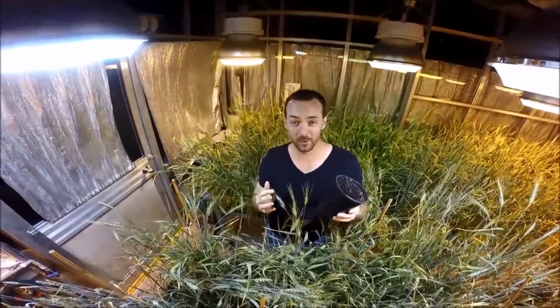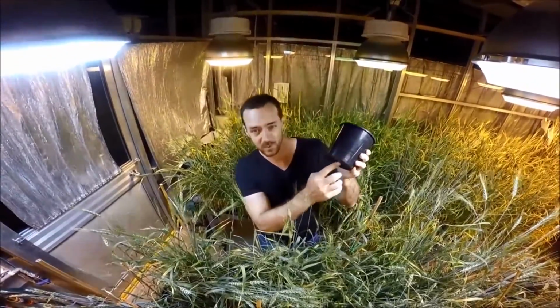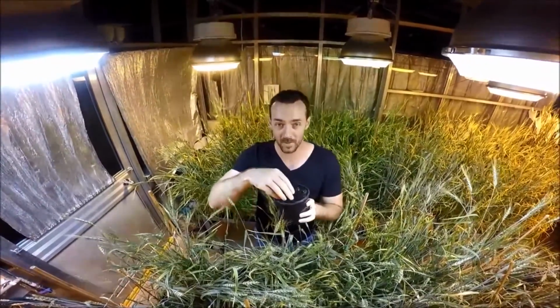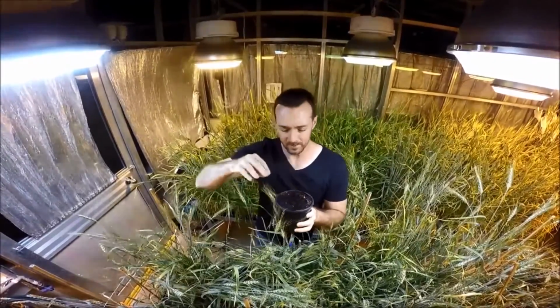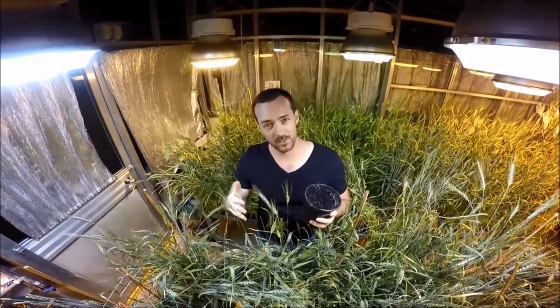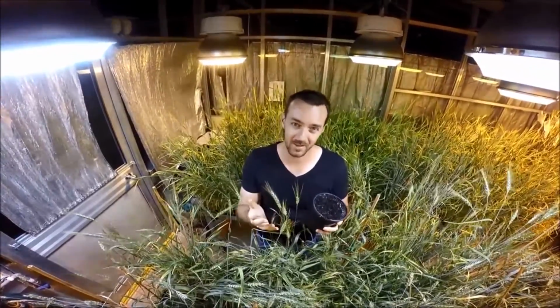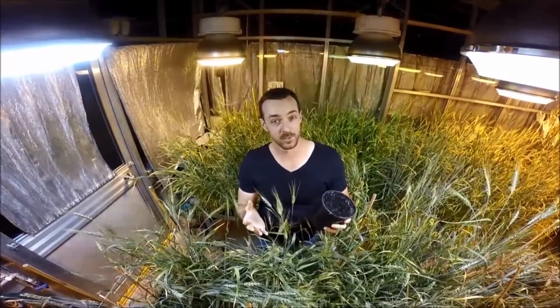Now, often we grow the wheat or barley plants in pots like these. They're called ANOVA pots, and they've got one small hole in the bottom, and it prevents the roots from coming out. Now, the media that we use is actually pine bark mix, and we add Osmocote when we're potting up. That's a slow release fertilizer, but we also add liquid fertilizer, as if we don't do this, we have a lot of problems with nutrient deficiencies because the plants are growing so fast. So they really need those nutrients readily available. Otherwise, we run into problems like copper, calcium and iron deficiencies.